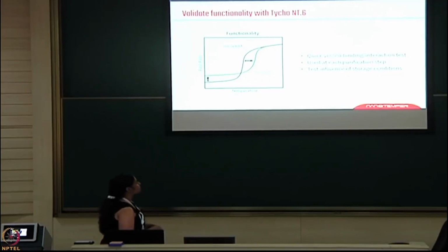Now here you can also check the thermal shift assay. I mean, a protein is there, and you want to check whether the protein can bind with a particular ligand or not. When you run the protein without the ligand, you will see a particular profile, and then in the presence of a ligand, the shift will change. The shift can either be a positive shift or a negative shift. If it is a positive shift, that means it's a true binder. If it's a negative shift, that means it's not a true binder. We can actually go for a yes or no on whether the shift is happening, I mean, whether the interaction is possible or not.